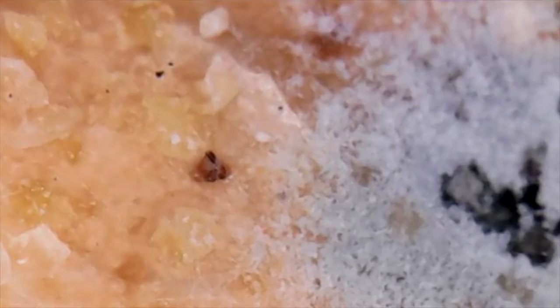If we compare this to the spaghetti hoops mold — you can click there to go back and have a look at that video — this one is much finer. As you've seen before, it's a tiny little dot of mold on the bread. Obviously if we left it for longer, the mold would grow and overtake the whole thing. Right in the middle there's a blackened dot, because this mold is really dusty — it just sort of flies away.